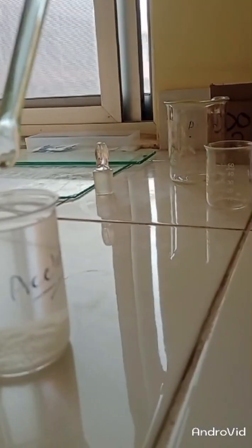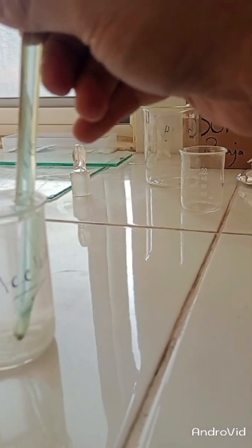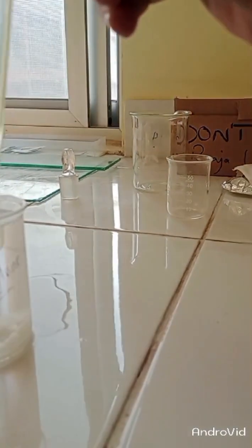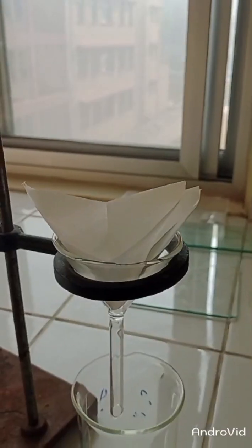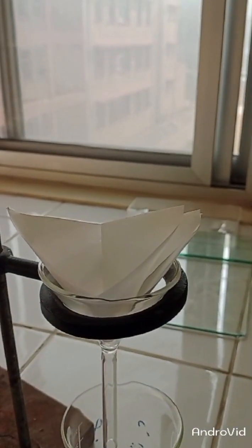At this stage, I have added a dehydrating agent, which is sodium sulfate, into my organic layer so that any water molecules present in this layer can be removed. This is the last stage of this purification technique.